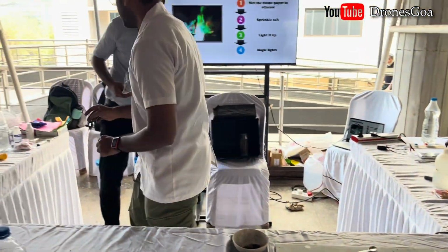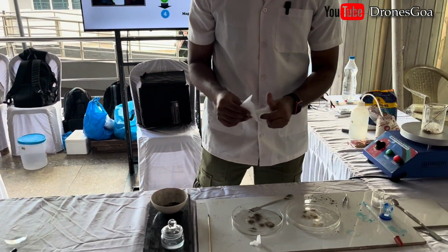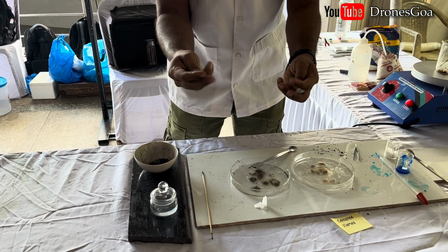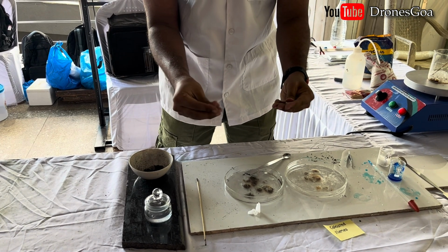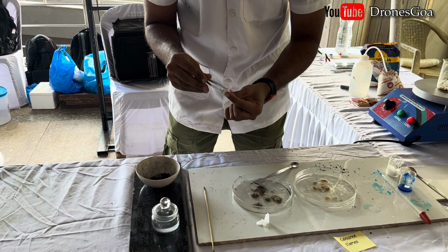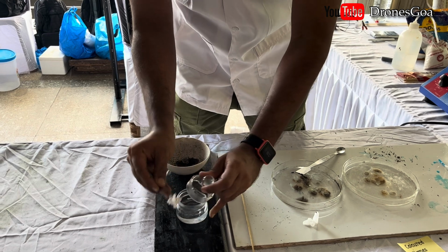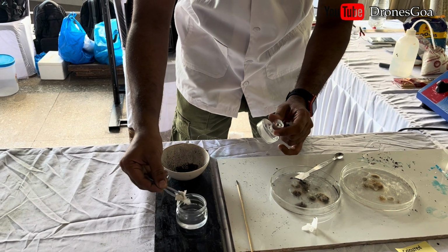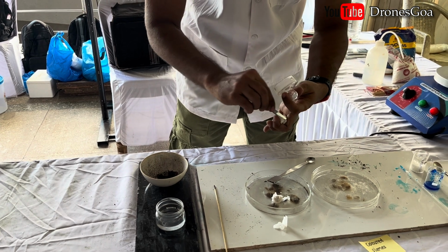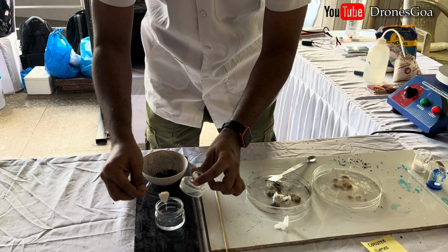So I have alcohol with me and a tissue paper. I'm just making two balls of this tissue paper, and I'm going to dip it in alcohol first. This needs to be done under the supervision of experienced people, elders. Do not try this at home.